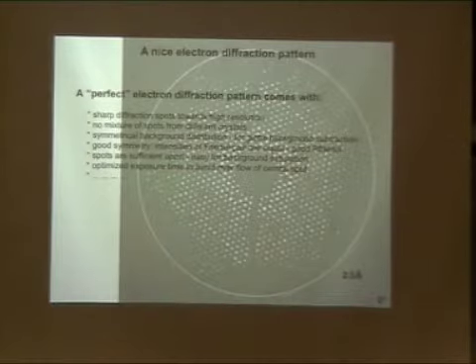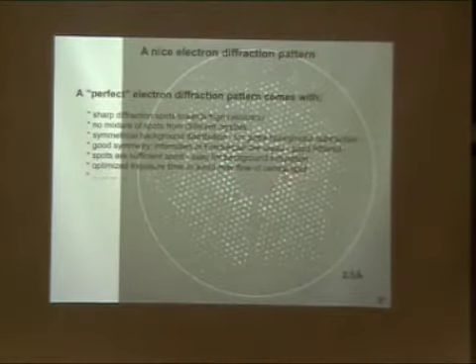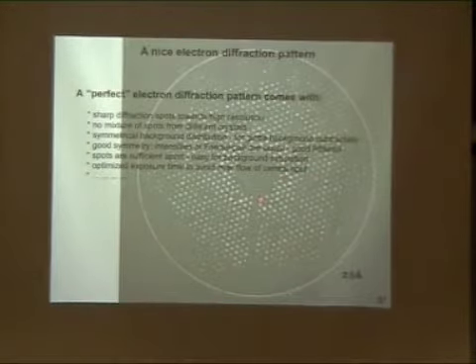The other thing you want is for the spots to be sufficiently apart. This is the same as in X-ray crystallography, right? You want spots to be far apart so you can do better integration. And you also want to optimize your exposure time to avoid overflow of the central spot, because the central beam is very strong. Usually we put a beam stop here, but even for a large crystal, sometimes you get a problem with overflow. So you want to optimize your exposure time. These are a number of things that you need to consider.